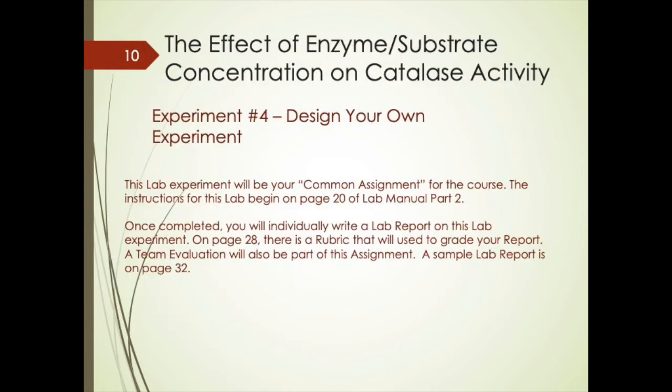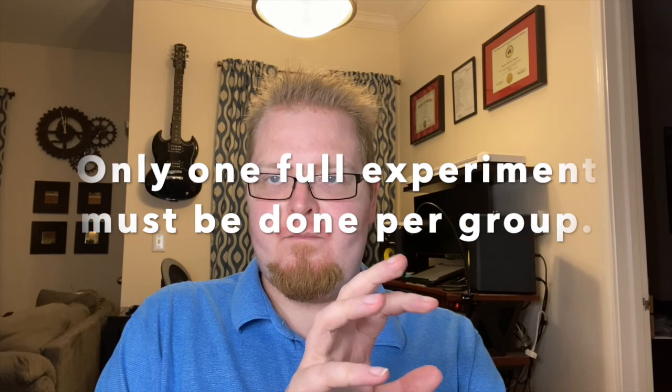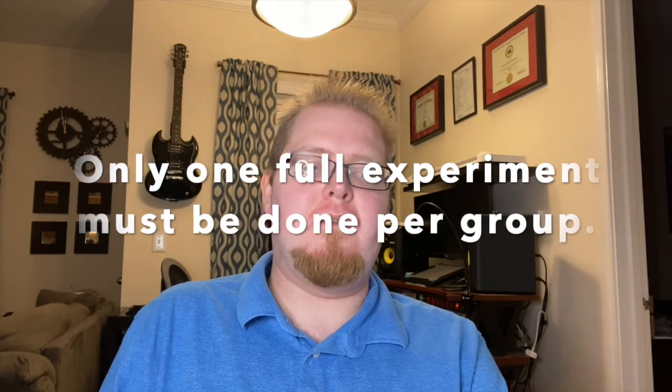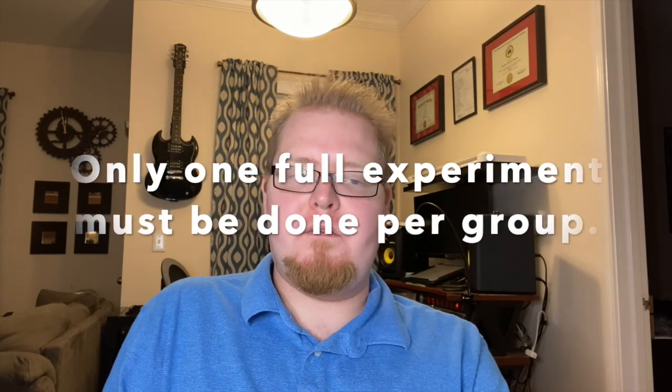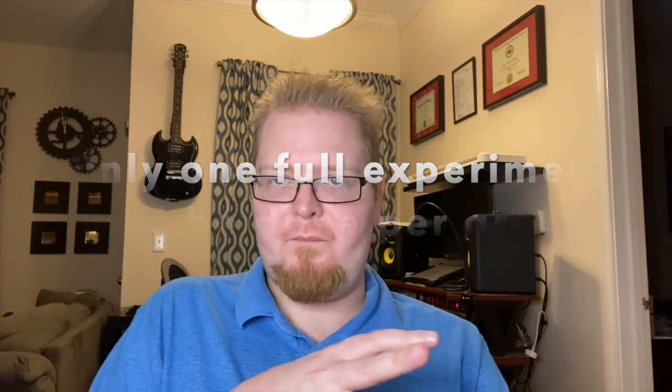This is where you need to design your own experiment. Okay, so in your lab manual, all right, each group is going to need to do this experiment. Okay, so I'll show you a video of one I did during the summer.